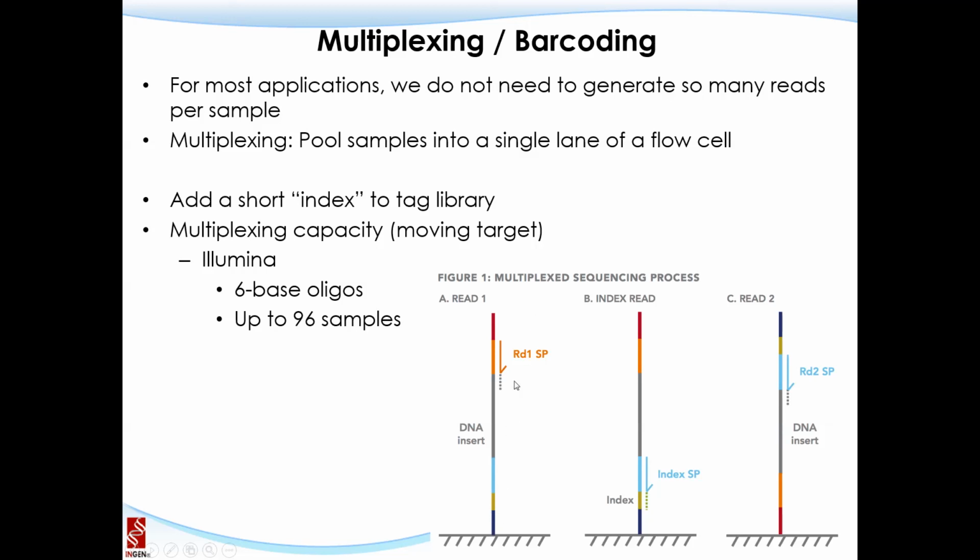You can see those are top and bottom. This is something called the adapter sequence. Those are the 2 things that we put towards the end of the molecule, and they are needed. Then there are a couple of different colors. The middle part is the DNA we want to sequence. And there are a few other sequences and colors.